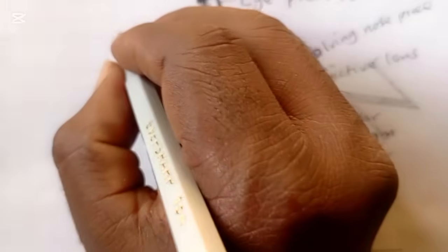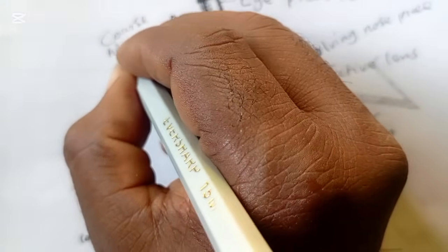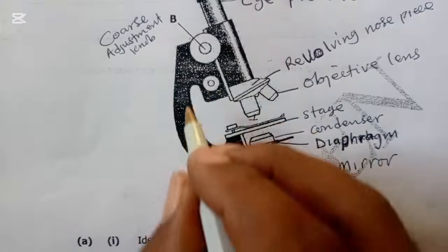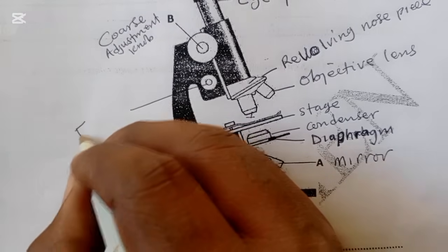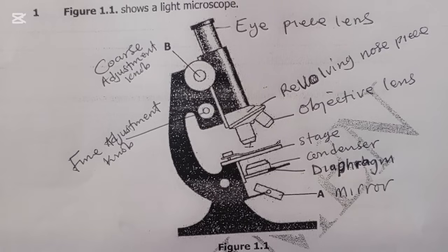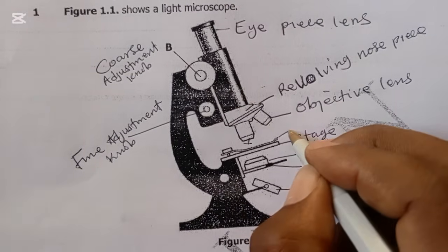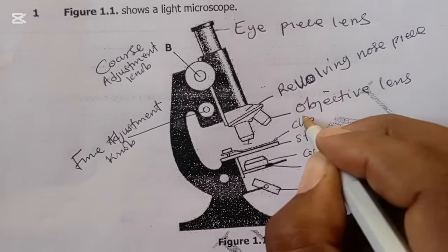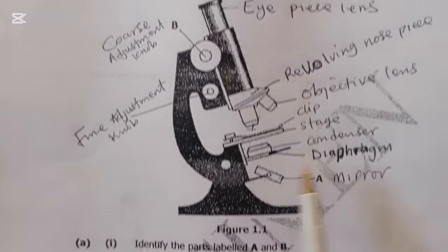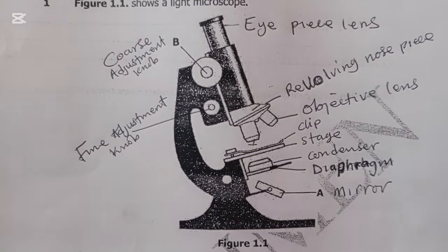And B, it is called coarse adjustment knob. And this is the fine adjustment knob. This is a clip. So A1, identify the parts labeled A and B. So we have identified A, it is a mirror. B, it is a coarse adjustment knob.